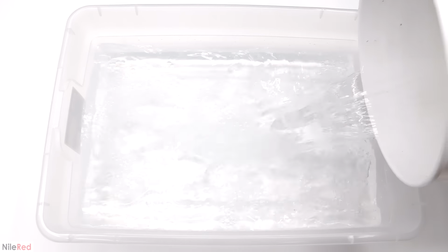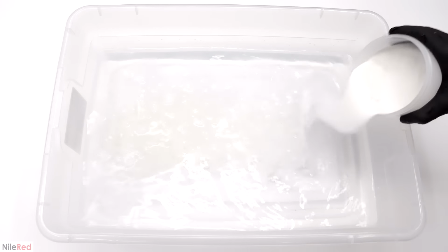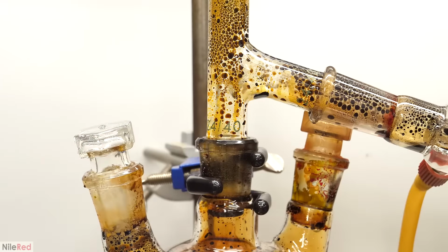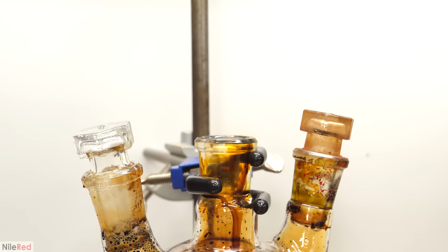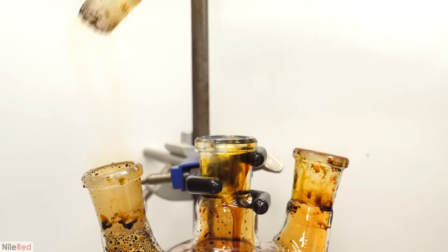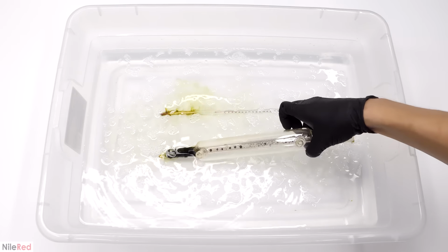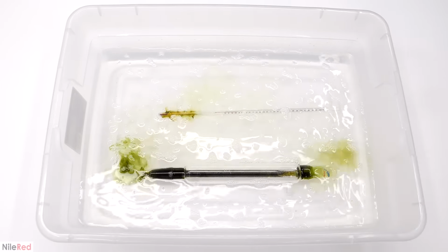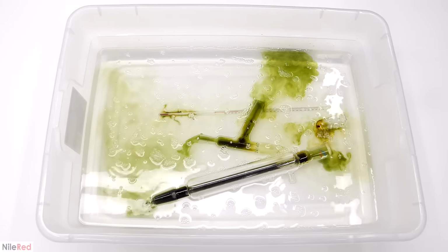To deal with this, the first step was to fill up a container with a solution of sodium sulfite. The concentration here really didn't matter though, so I just filled it with water and threw in a random amount of the sulfite. Then, I took the setup apart as carefully as possible, and I tried to not spill any of the chromyl chloride. However, dropping a small amount of it was almost unavoidable. Every piece was dropped into the sulfite bath, and the red color quickly turned green because the chromium was being reduced. This was converting it from its nasty and red 6+ oxidation state to its green 3+ one, which was much safer and not nearly as toxic.